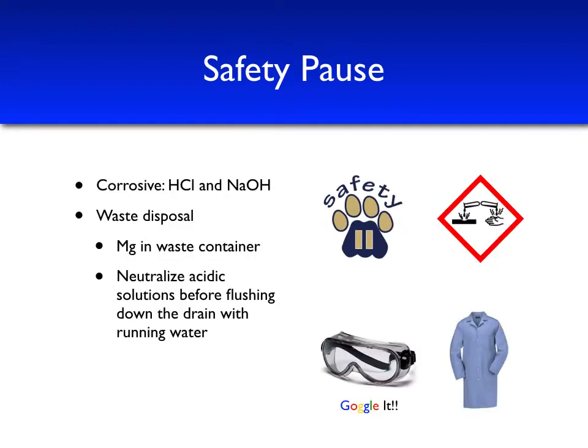For today's safety pause, we note that hydrochloric acid and sodium hydroxide solutions are corrosive. We also note some special instructions for disposing of waste. We want to make sure that we collect magnesium, a flammable metal, in a separate waste container and neutralize any acidic solutions before flushing them down the drain with plenty of water. And of course, we'll make sure that we wear goggles and a flame-resistant lab coat.